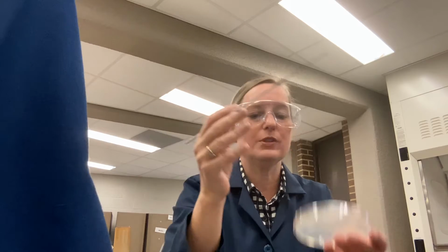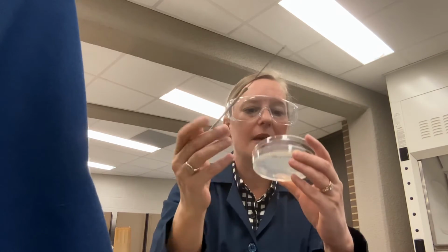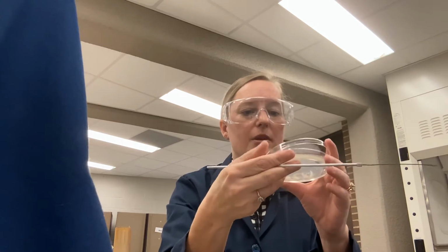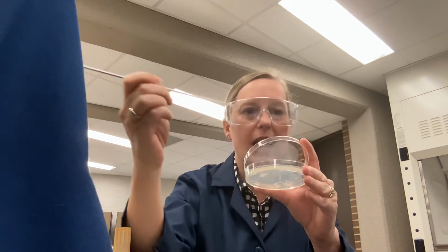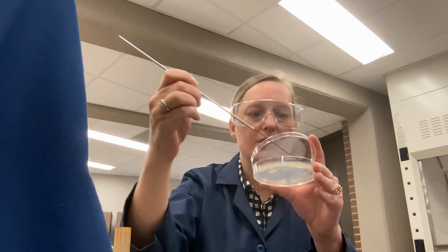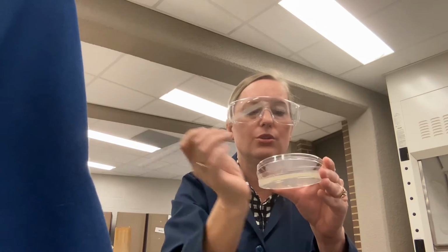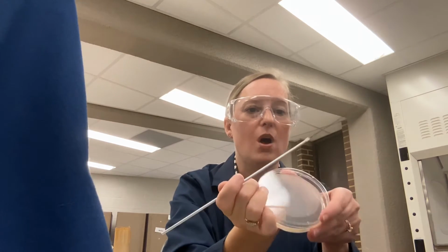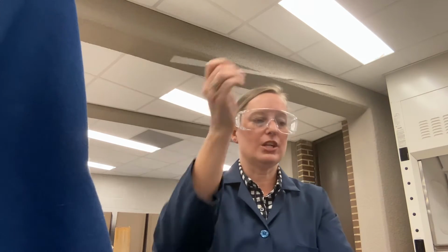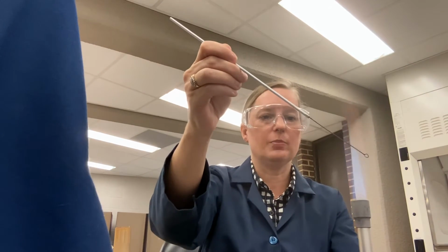So now that the loop is cool, I'm going to barely lift the lid, and I'm going to go from my zone 1, so here was my zone 1 right here. I'm going to go to zone 2, and I'm just going to drag, so here's my loop, and it's kind of hard to do this because you're going to do it flat on the table. I'm just going to drag 3 or 4 lines into zone 2. So from 1 to 2, 1 and 2 are going to overlap, and then that's it. So I'm going to flame my loop again. So again, we're flaming that loop again.